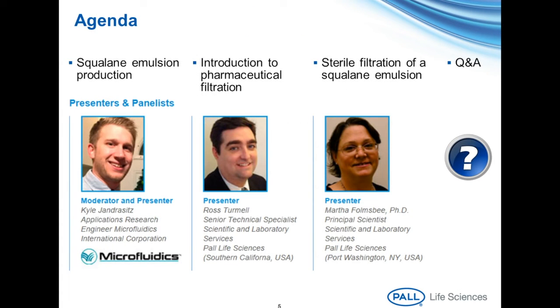I'm going to start off today by giving an introduction of the microfluidics technology and talk about the production of the Squalane nanoemulsion using the microfluidizer. I will then pass it off to members of the Pall team to give an introduction of the pharmaceutical filtration process, as well as talk about the sterile filtration of our Squalane nanoemulsion. We will wrap today up with some question and answers.